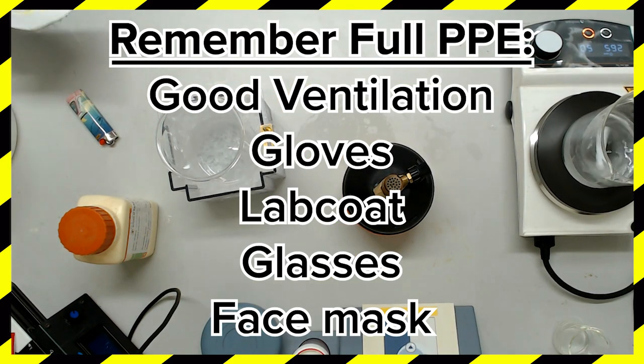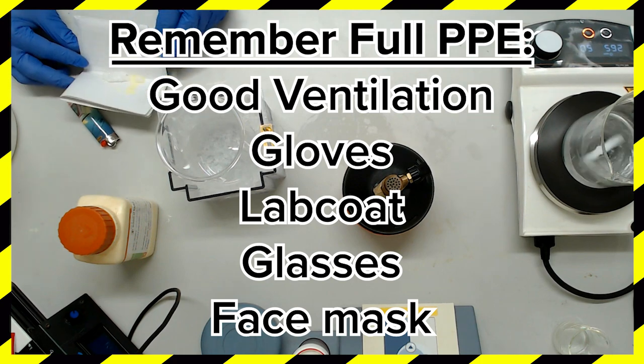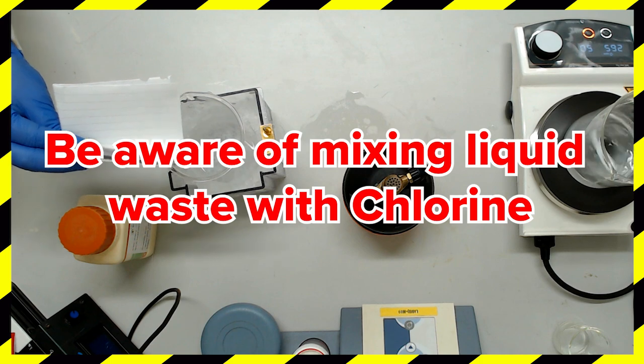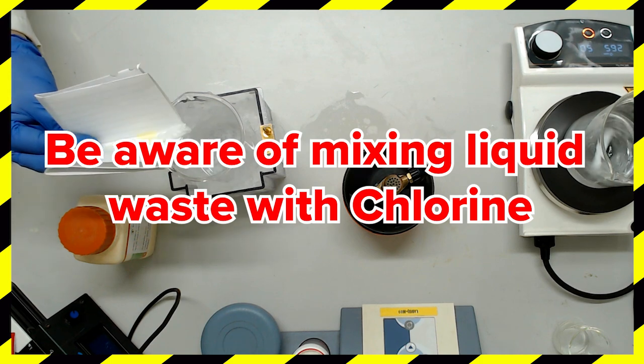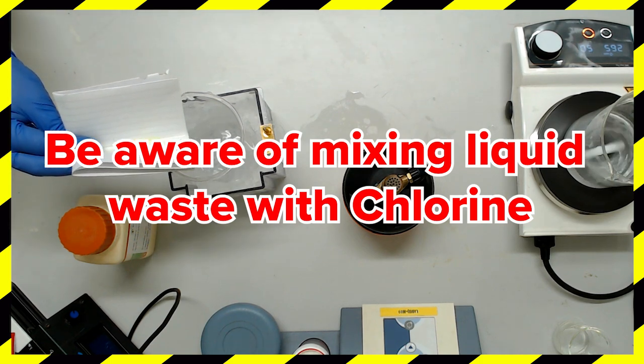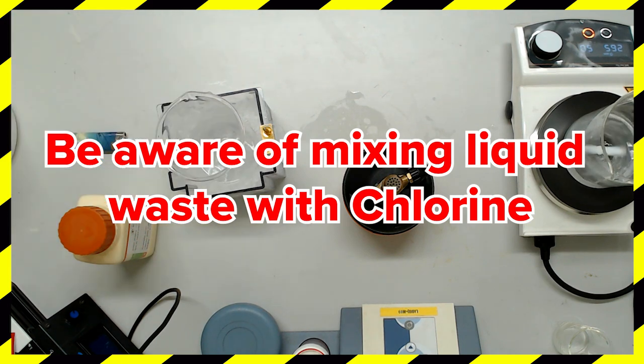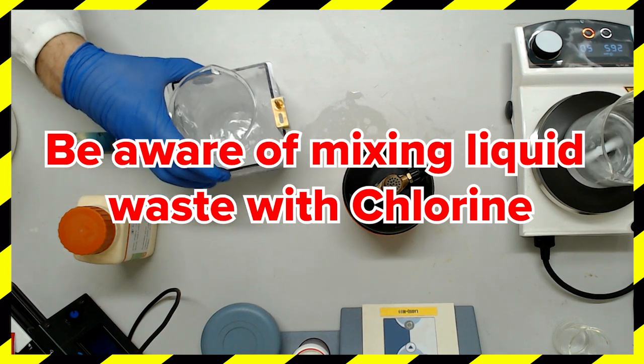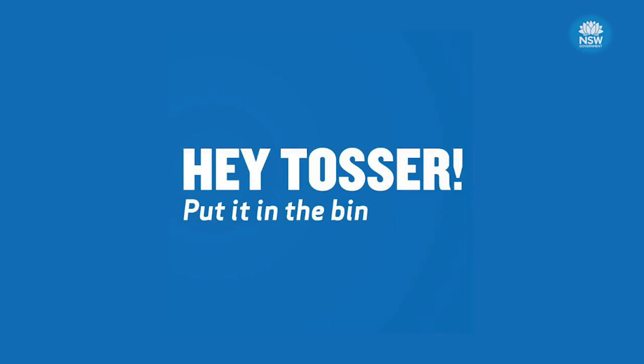This is a good time to note that you should have a liquid waste container on hand for the disposal of mini prep solutions. Keep your mini prep waste away from your regular liquid waste container. The presence of chlorine makes this halogenated waste. The wrong chemical added to your mini prep waste might result in the release of toxic chlorine gas. Take care you don't turn your lab into the western front of WWI. Find a waste disposal company that can dispose of chlorinated waste. Don't be a tosser.